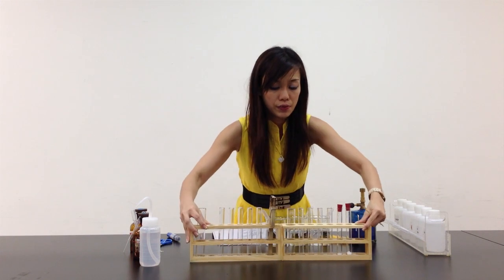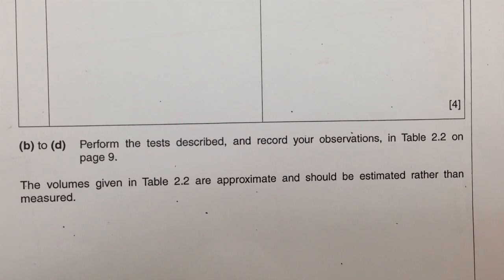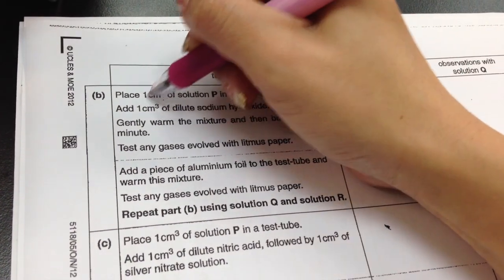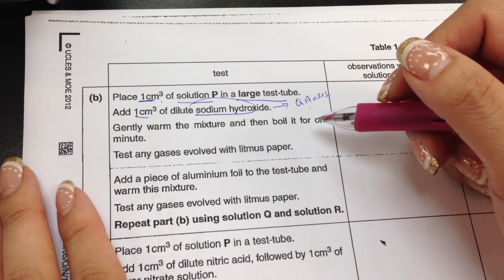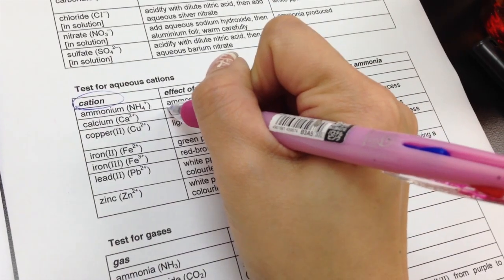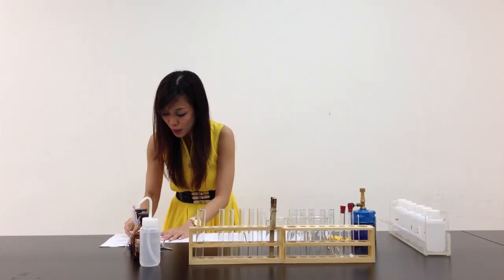Let me move this aside and put my splint in front. Part B says: place 1 cm³ of solution P in a large test tube and place 1 cm³ of dilute sodium hydroxide. Sodium hydroxide — we have to refer to the QA notes. The QA notes say that when you add sodium hydroxide, it's to test for cations. However, it says gently warm the mixture and then boil it for one minute and test for any gases evolved with litmus paper. According to the cations table, the only one that will give out a gas is ammonia. To test for ammonia gas, you use damp red litmus paper — it should turn blue.